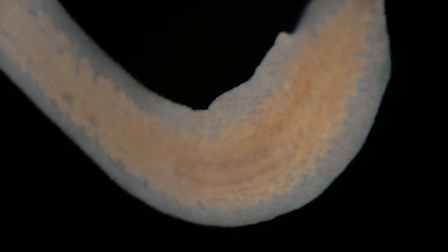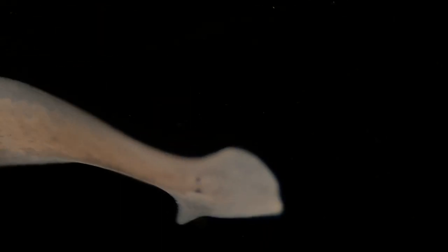Now, another cool thing to know about these guys is that they have these beautiful little floppy ear-like things on its sides. Those aren't just for looking cute. Those are actually chemical receptors, and so that basically allows them to, quote unquote, taste the water and what's around it. With what's in the water, they will go towards their food.